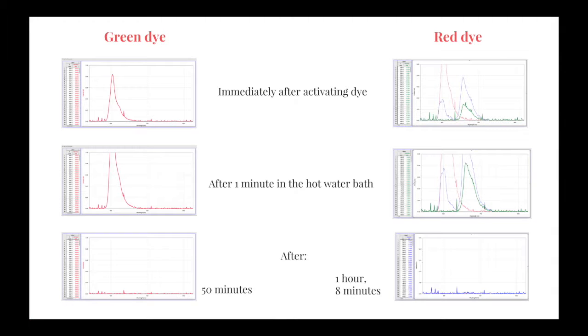Here we can see the emission spectra of both green and red dye. The first two were taken immediately after activating the dye, and the second two were after having the dyes spend 1 minute in a hot water bath. If energy input does not affect emission intensity, after being placed in the water, the emission intensities would not change.